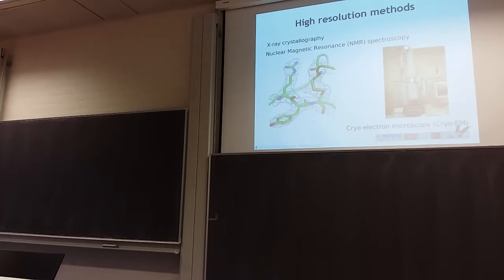So anything of 3 angstroms resolution or below is sort of atomic. Real atomic is about 1.5 angstroms, because then you have some precision with which to determine where this carbon should actually be found. Cryo-EM is getting to resolutions of about 4 angstroms. Not quite there, but it's amazingly close.